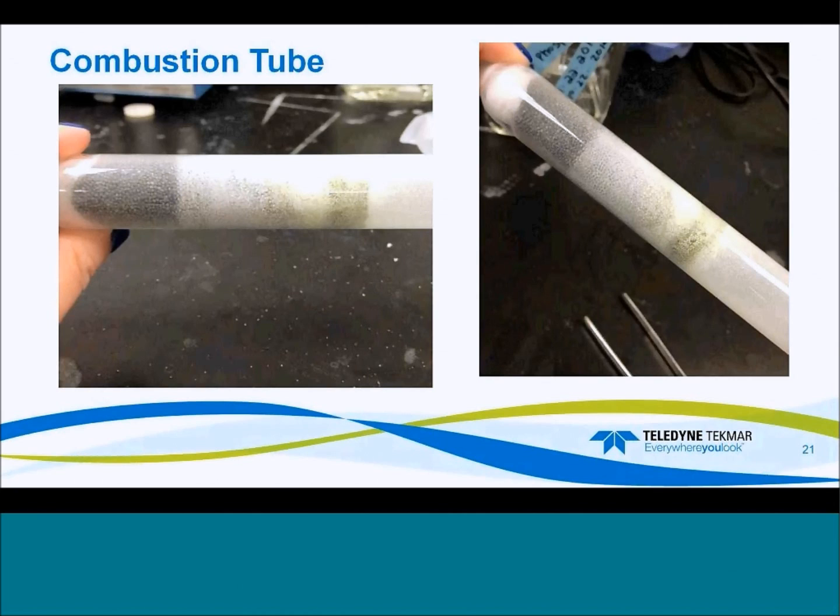And then finally, if you put a new combustion tube in, verify that you have 200 milliliters going in and 200 milliliters going out, and that you don't have any blockages anywhere.